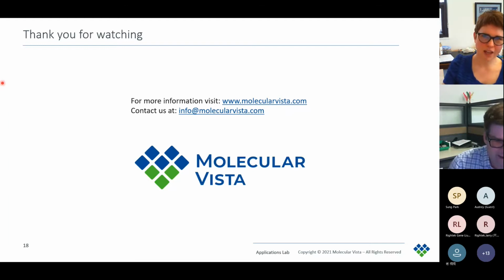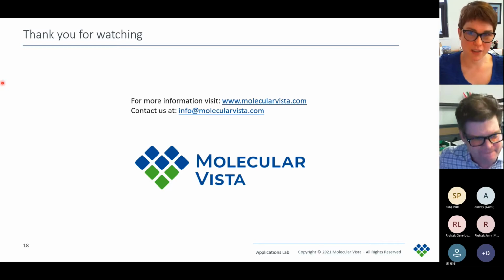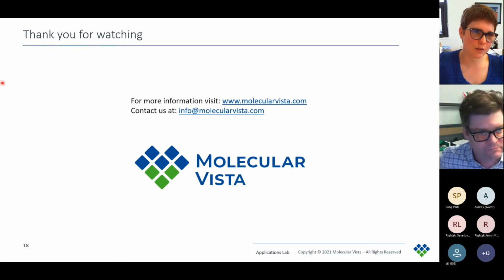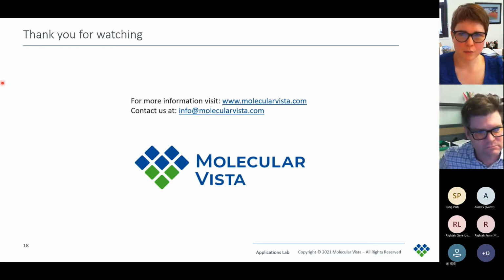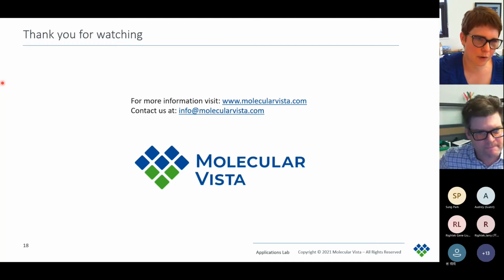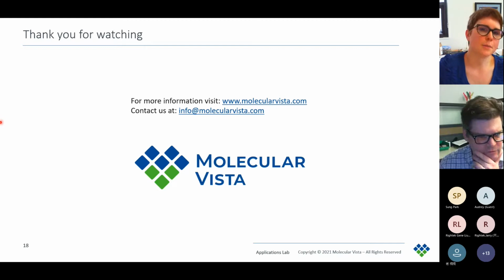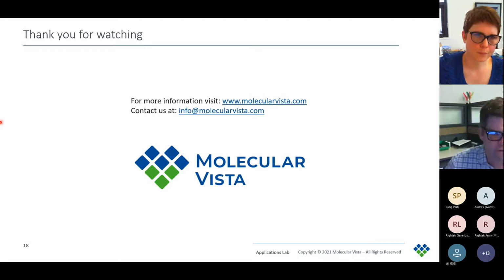Yeah. Okay. It's also important to remove the little colloidal silica particles, because they otherwise stick quite well to the surface. So this will just be flushed under RO water or any available water, and then just popped into the ultrasonic for a few seconds. I see. And is that something you did with the samples we looked at together? Yes. Okay. Excellent.